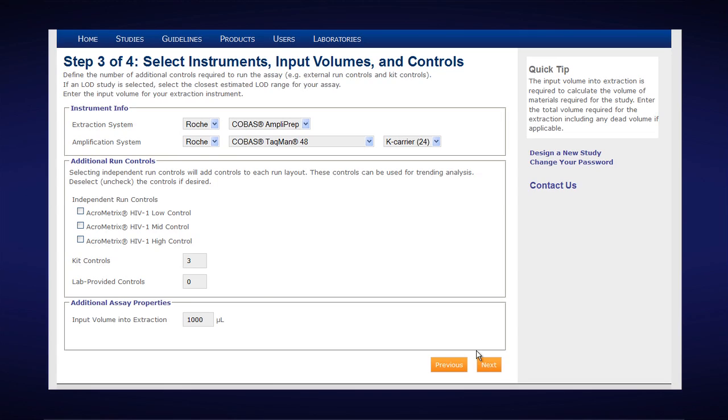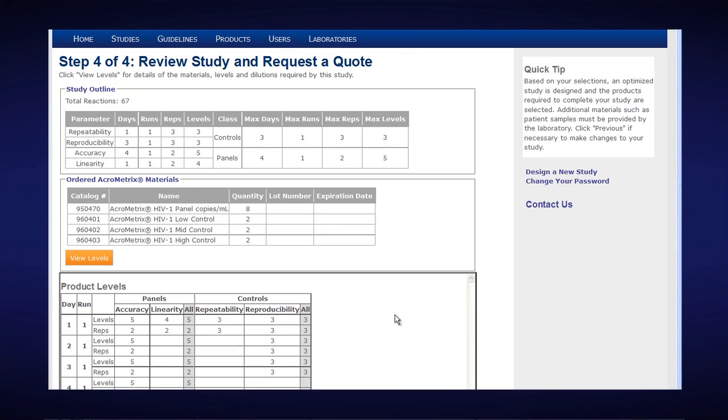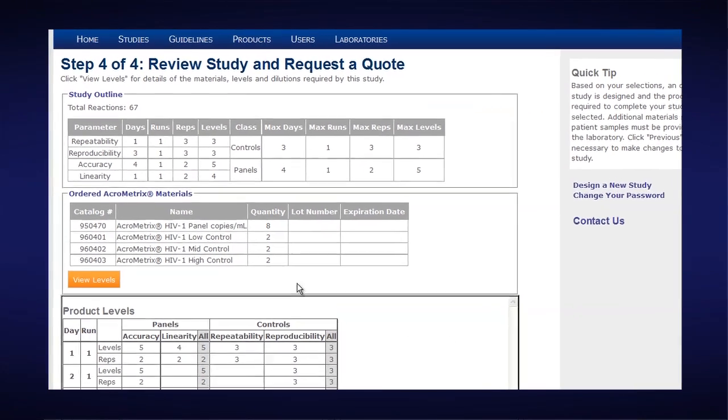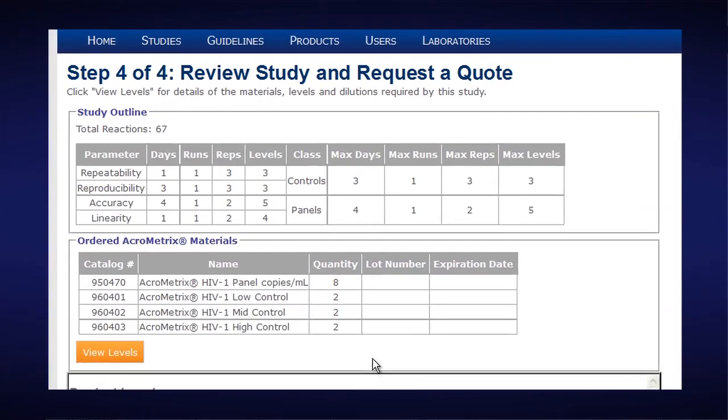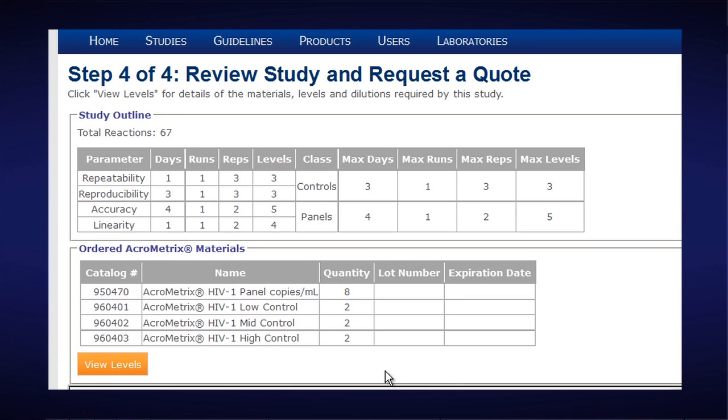We'll click on Next. And now we have an outline of our study. This is the fourth of the four easy steps. It's telling us we need to run 67 total reactions.